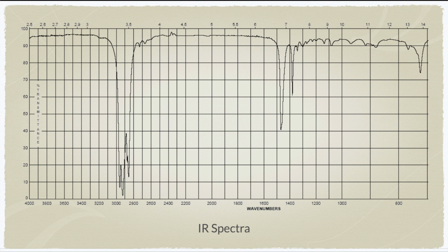If there is no absorption, then transmittance will be around 100. If there is absorption, the transmittance can go down to 0. So here we see a dip in the spectra. So this is called a dip. Here also we have a dip, but this intensity is less. Okay, so we read the IR spectra upside down.